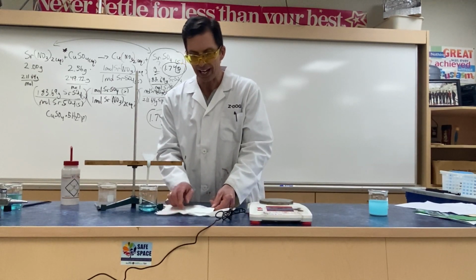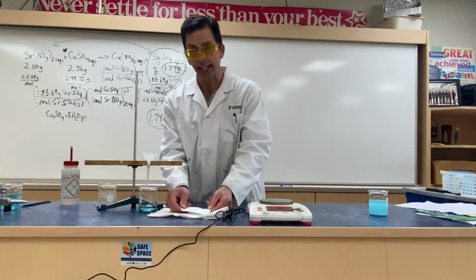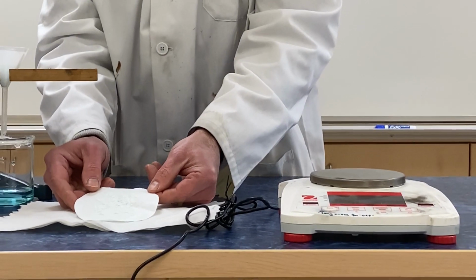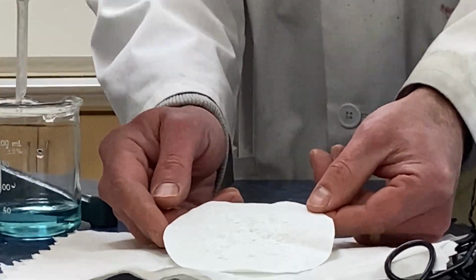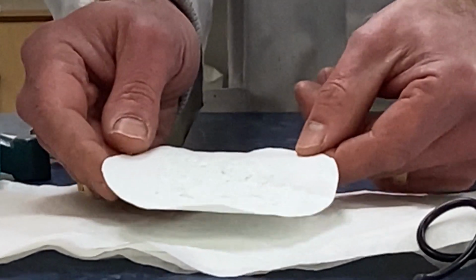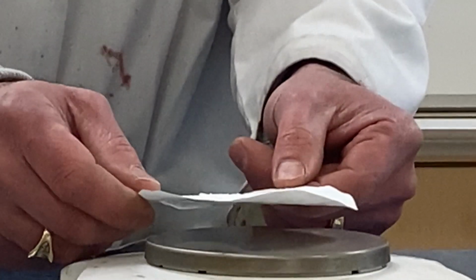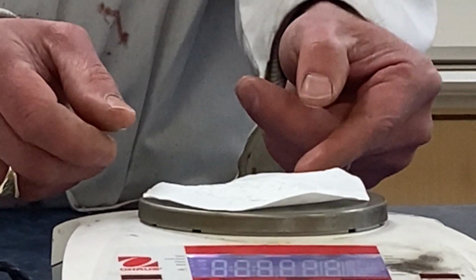Overnight, we have dried our precipitate. Can you get a close-up on this? Well, we have a light blue white fine powder on our pre-massed filter paper, which was 0.69, 0.70 grams. Very carefully, we transfer this over to a balance scale. If you can use a centigram balance, measuring with 2 decimal places, so much the better.